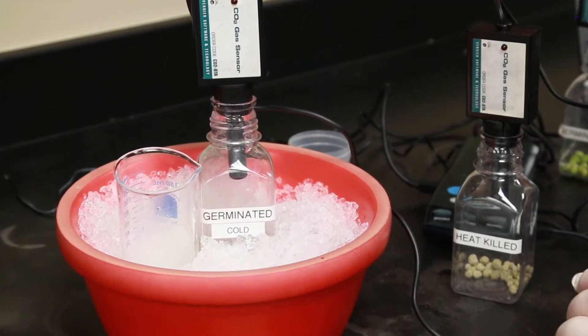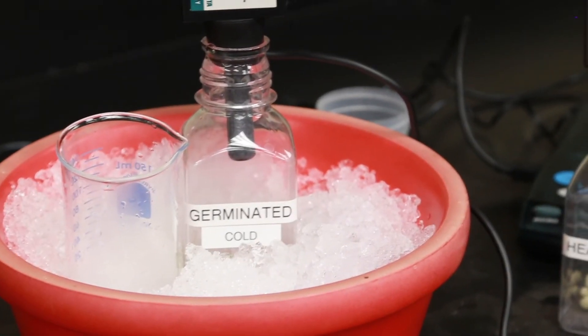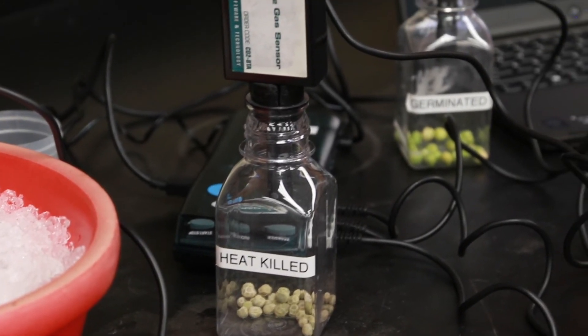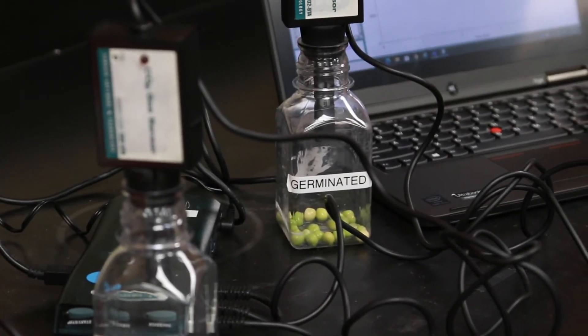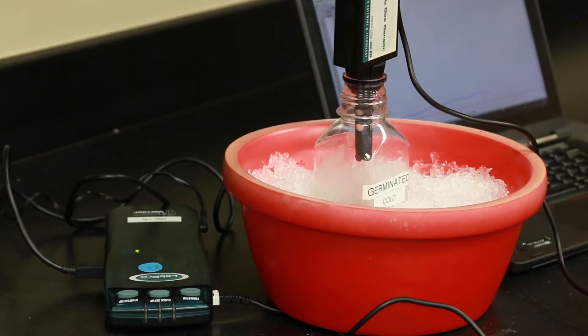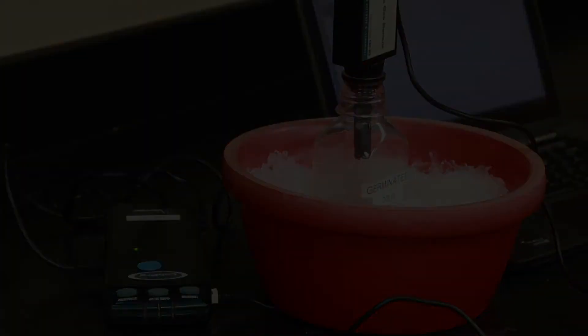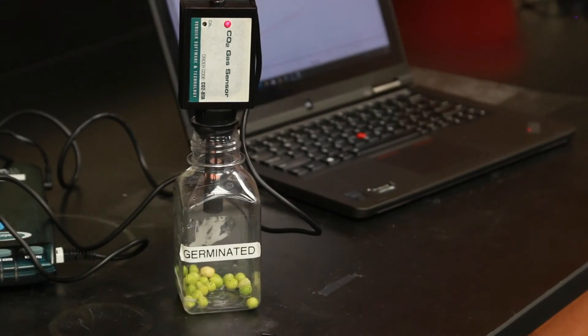Once everything has equilibrated we're now ready to begin collecting some data. So here we're just taking a look, we're going to be measuring data for cold peas, heat killed peas, and room temperature germinated peas. Here we have data collection for the cold peas, you can see the light blinking on the sensor that's telling us that data is being collected. We also have the sensor collecting data on heat killed peas and finally here on the germinated peas.